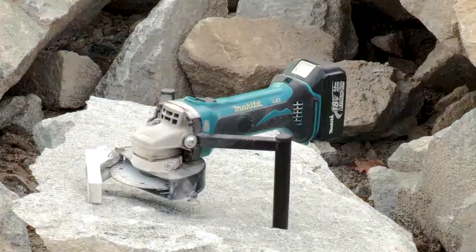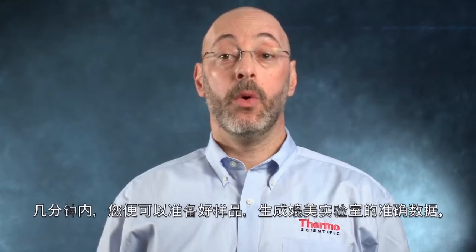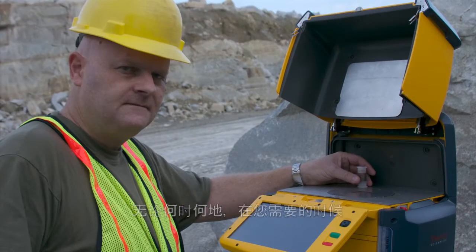In our continuous efforts to help bring the lab to the field, we are pleased to present the first ever Direct Rock Sampler Field Kit. Within minutes, you can easily prepare your samples to generate lab quality data where and when you need it. I will let my colleague, Marc Duparat, demonstrate this for you.